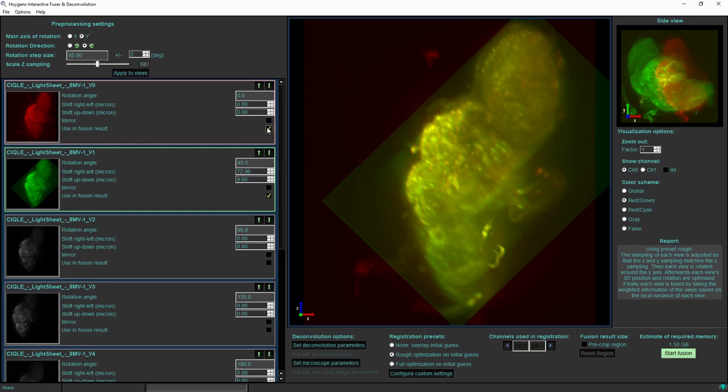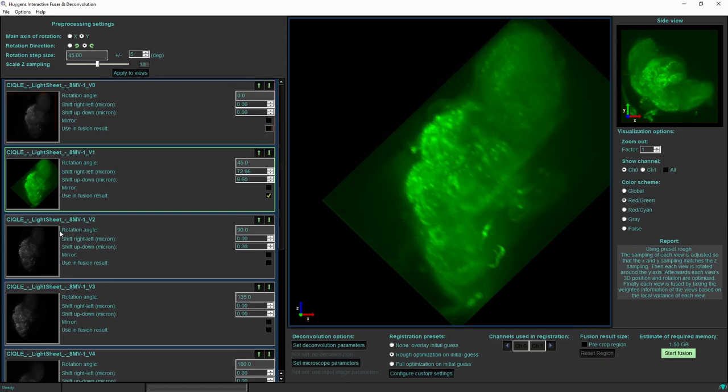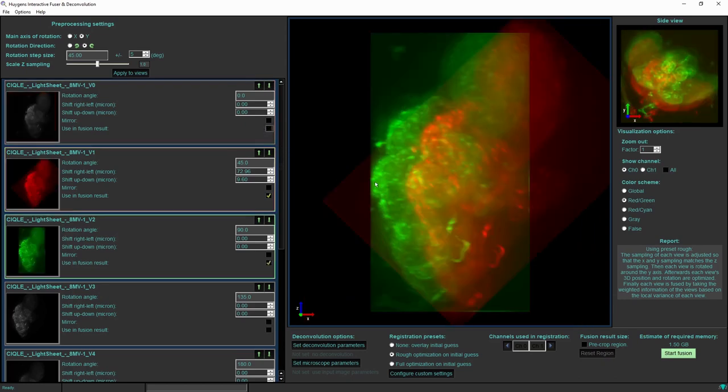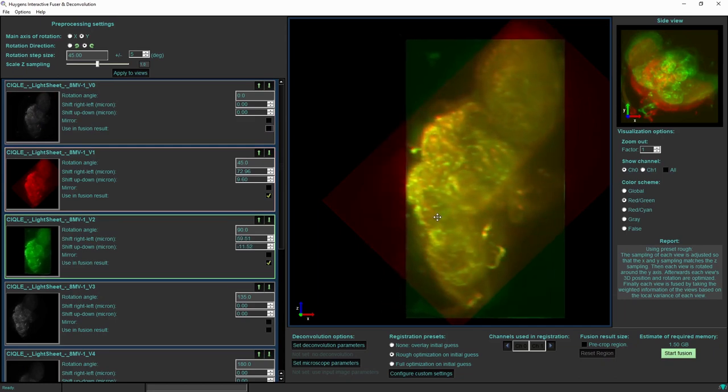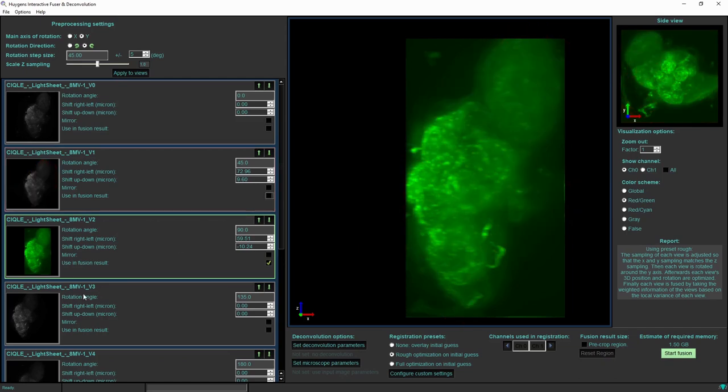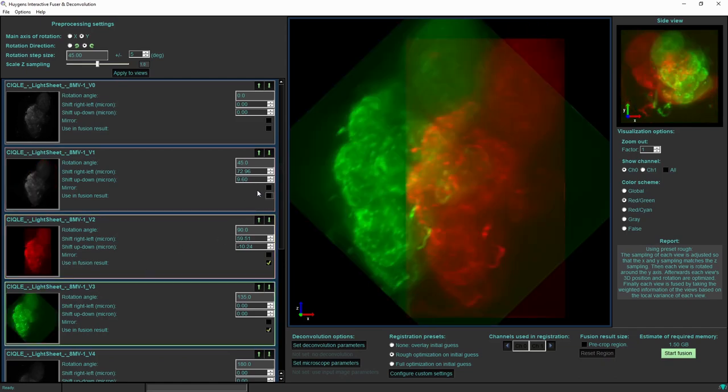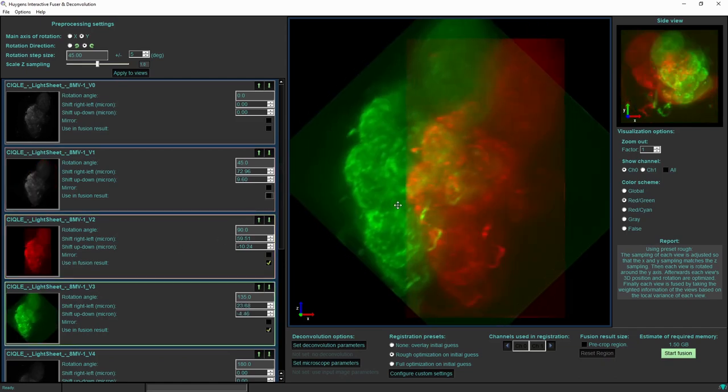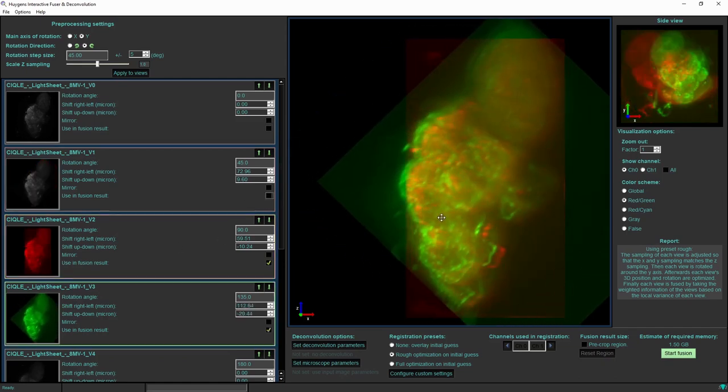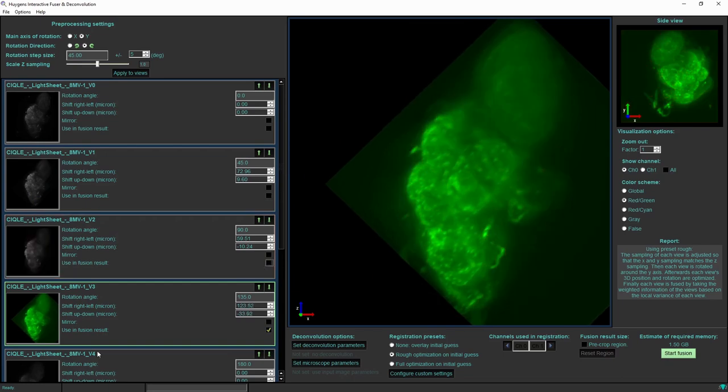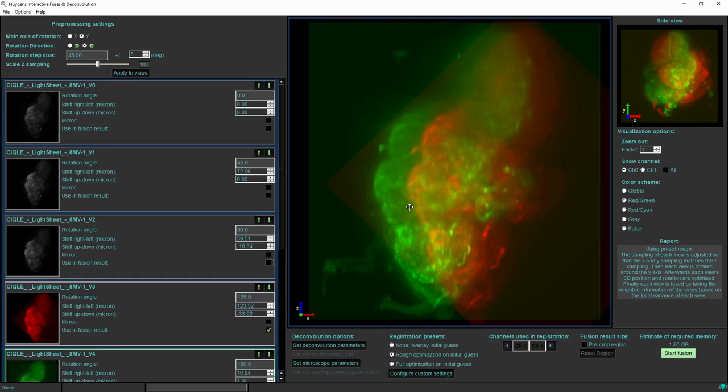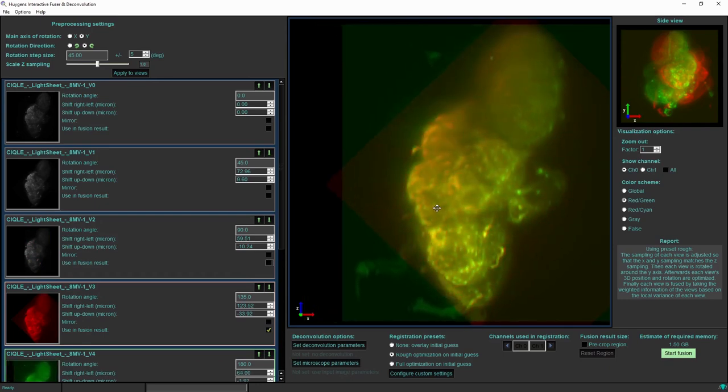In our experience a good way to align multiple views such as the eight views that we have in this example dataset is to always have one view visible in red, namely the one that was added last, and then add one next view in green and overlay it.